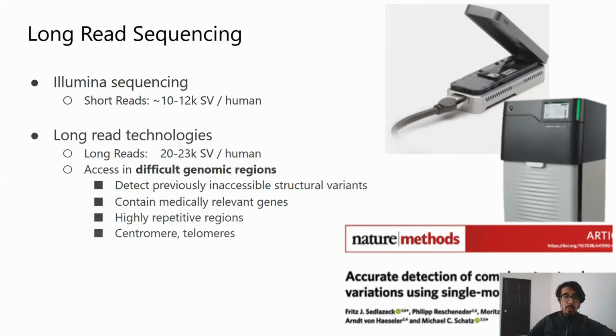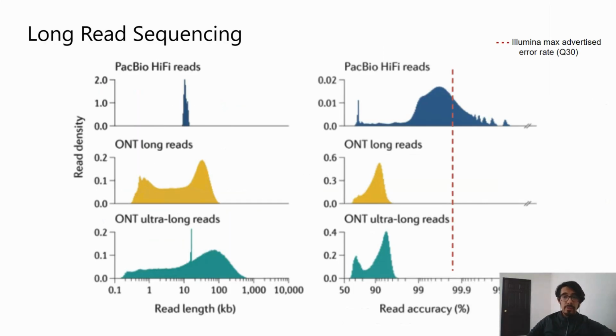With both Oxford Nanopore and PacBio improving their sequence quality, and soon reaching levels of Illumina-like errors along the genome, long-read technology is no longer a novelty, and population and production scale studies are now a reality. We can see here that PacBio HiFi has improved accuracy with the drawback of the reads not being too long, with Oxford Nanopore falling behind in accuracy, but reaching read lengths in the hundreds of kb with their ultra-long technology.